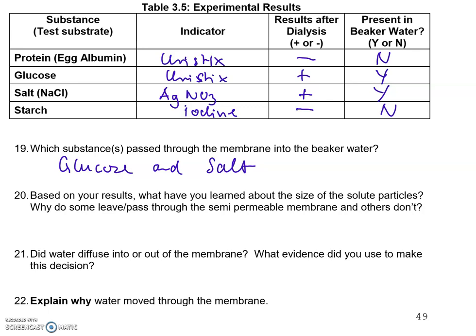So why do some leave or pass through the semi-permeable membrane of this dialysis tubing, and others don't? Well, it's clearly on molecular size. So glucose and salt are small by molecular size.